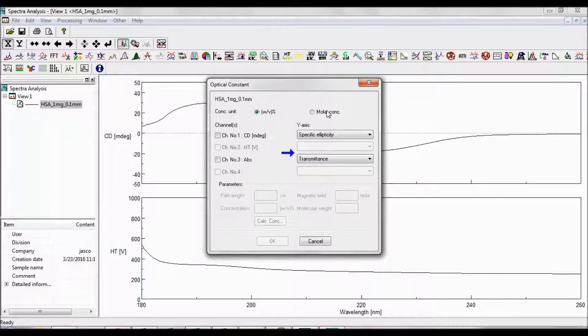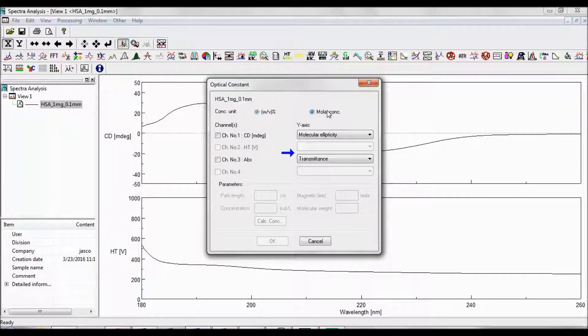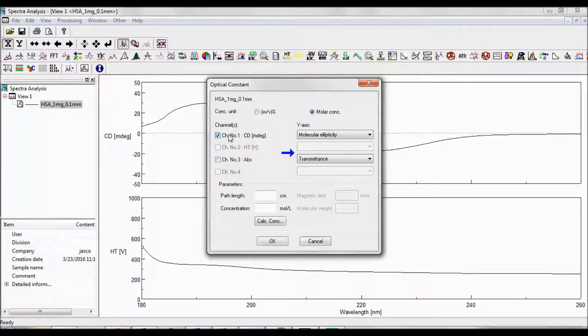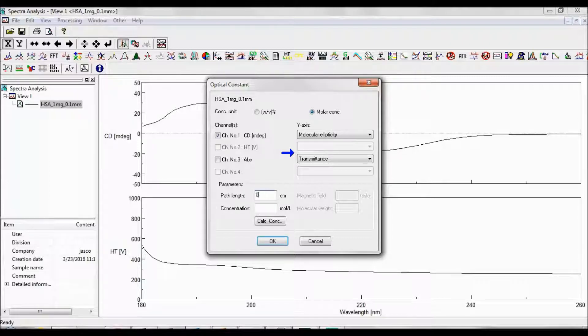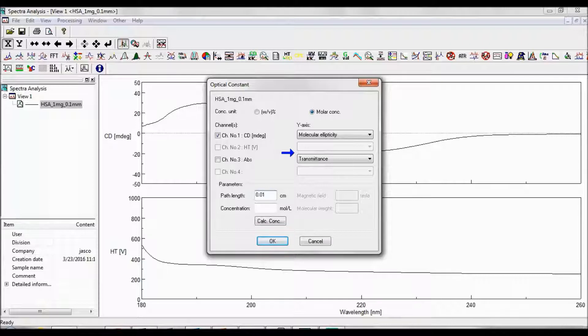Choose Molar Concentration, and then select Channel 1 to convert your CD data to units of molar ellipticity. Under Parameters, enter the path length of the cell used for your experiments in centimeters, as well as your sample's mean residue concentration in moles per liter.